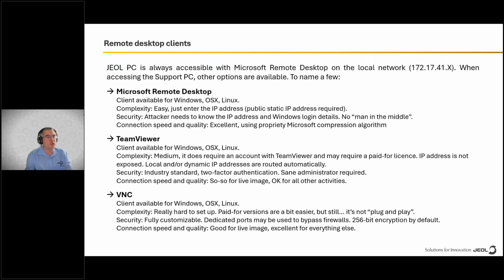Theoretically, you could also use Microsoft Remote Desktop to log in from the wider internet to the support PC. This is not something we encourage because it's not that secure.